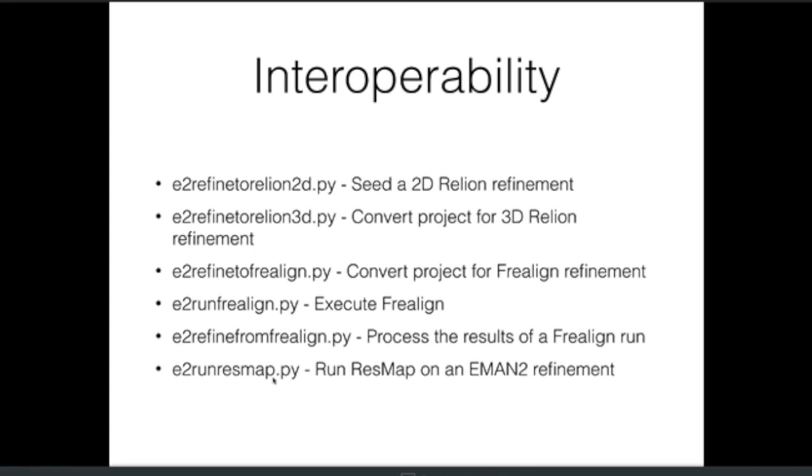So these are the commands that are actually used to perform the interoperability, although again, many of those are available through the graphical interface.